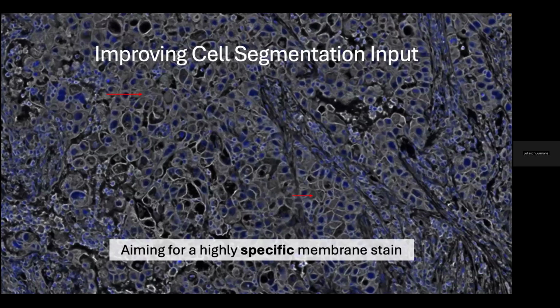second and just kind of take in the image, what we'll notice is that there's a lot of background staining within the cytoplasm of the cells. And there's not a very high contrast of the membrane to the cytoplasm. Looking specifically here, you can't tell largely the difference between what is membrane and what is background. And same thing up here. If we think back to the issues I presented at the beginning of this presentation, where we have missegmentation, oversegmentation, undersegmentation, an image like this would be very difficult for an algorithm to work with. It will get most of these cells wrong.